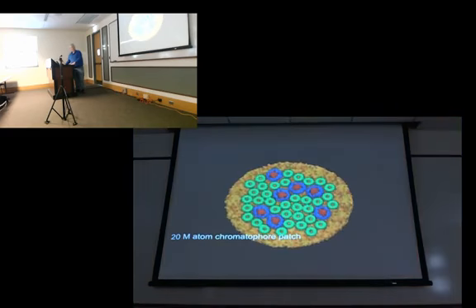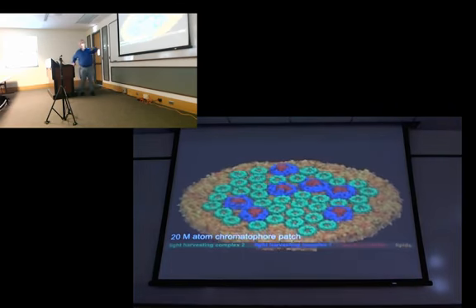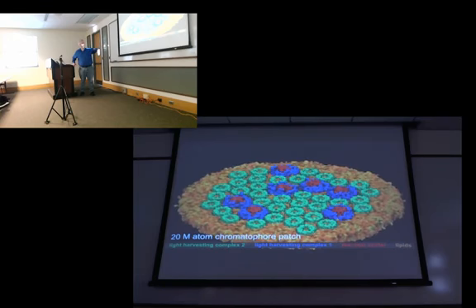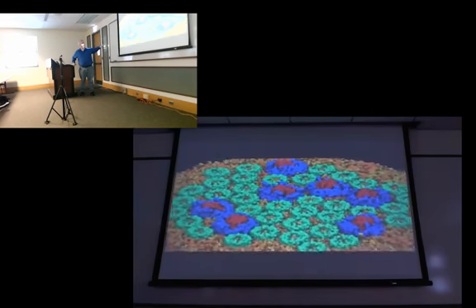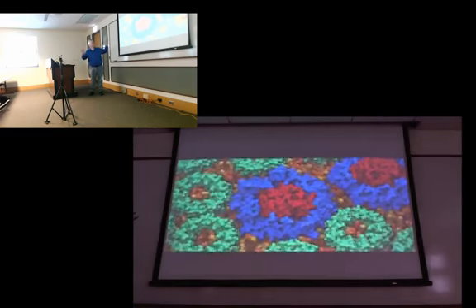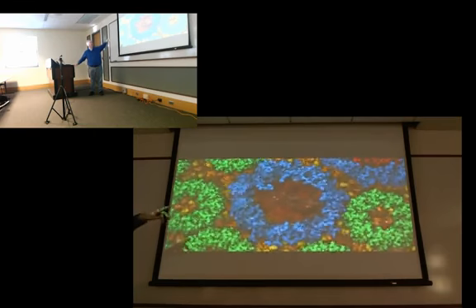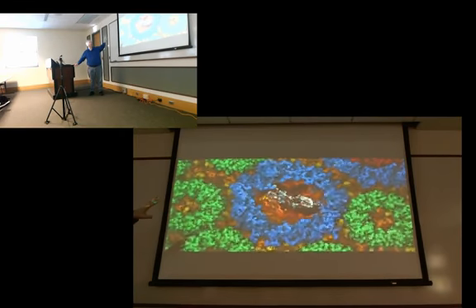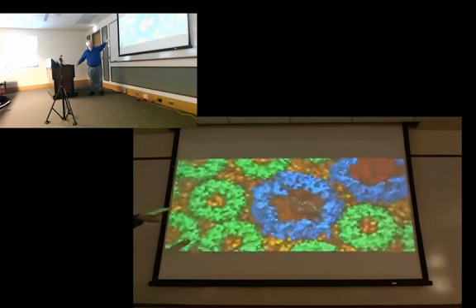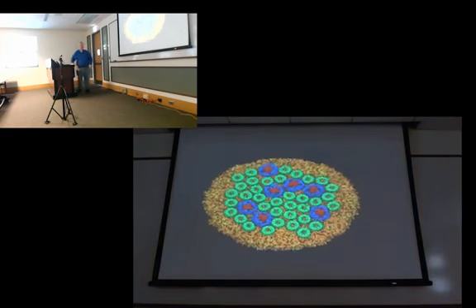So here's another one. This is an example where we take QuickSurf over this photosynthetic patch, and we start initially with a very coarse representation, and as the camera flies in, we make the surface more detailed. So now you can see atomic detail. We change part of the interior to be transparent, and we put a light inside, and it lights up the interior. I'll let this loop again so you can see that.